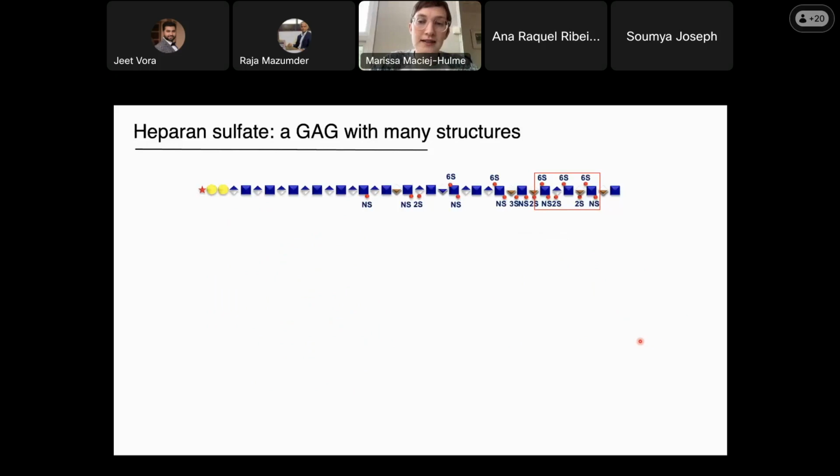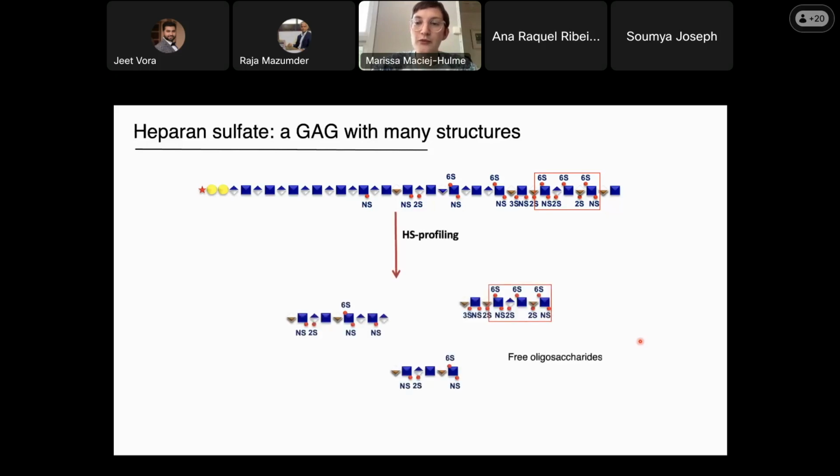So oligosaccharide GAGomics can begin to answer some of these questions by retaining biological structures and the natural heterogeneity of samples. Some free oligosaccharides already exist from the action of endogenous heparanase. Other structures can be generated from controlled bacterial lyase digestion, if warranted, and possibly new GAG-specific enzymes that may be discovered in the future with different specificities.